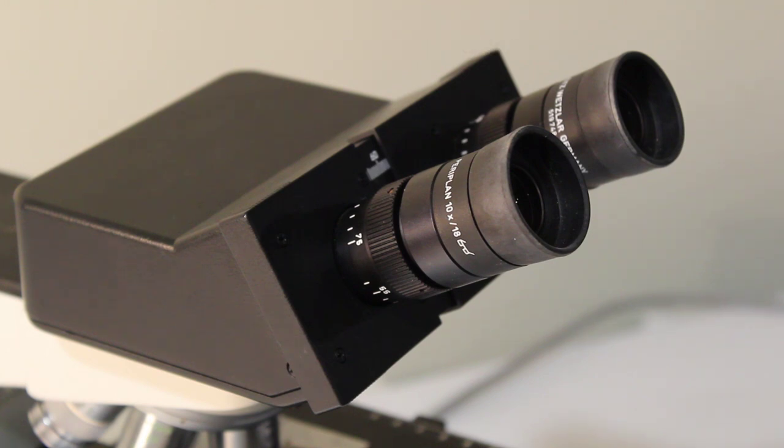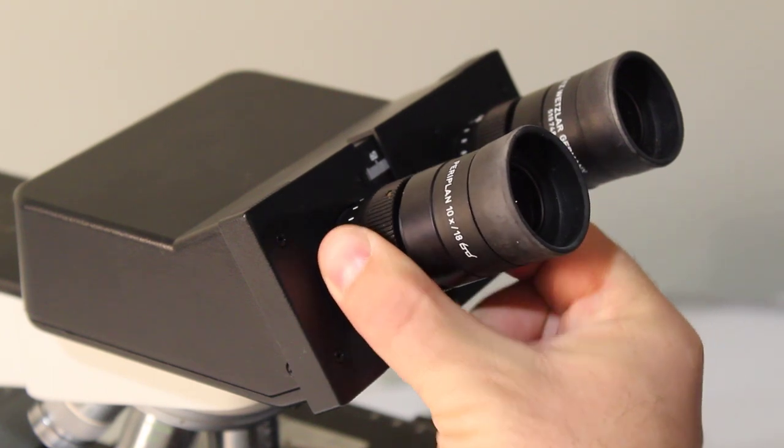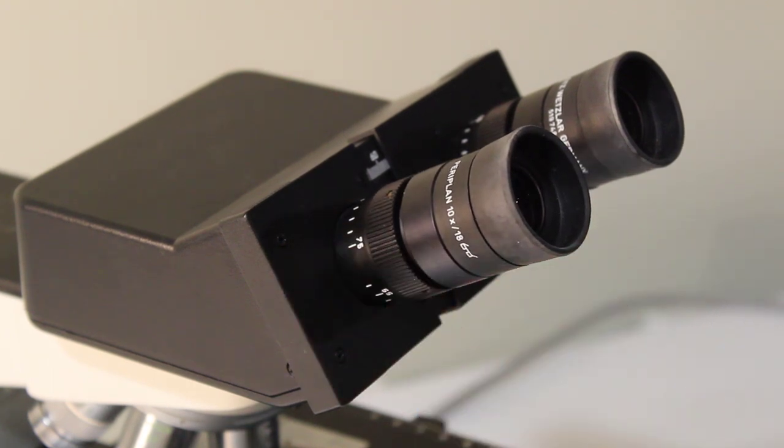If you have a binocular head you may also have a diopter adjustment which is what these little ticks here are on the bottom. These are for people who wear glasses so that you don't need to wear them while you're working on the microscope.